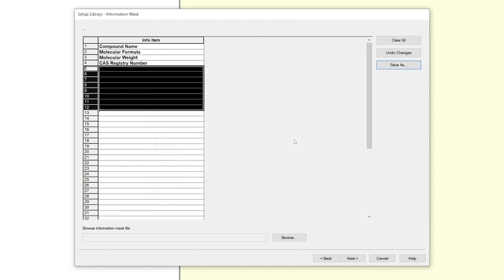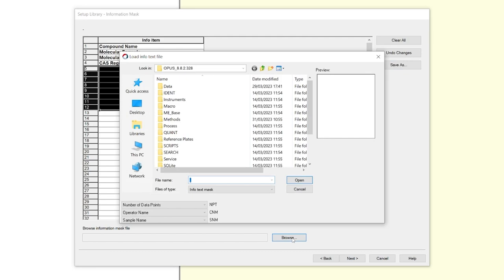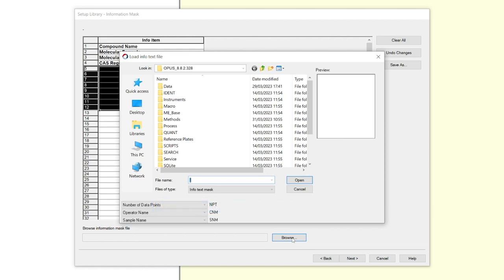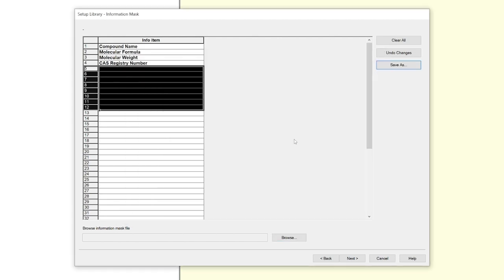If you want to open an existing preset, you can do so with the browse button at the bottom. The path of the pre-installed masks is the install path of your latest OPUS version, then either in the folder methods or in the folder data library. Regardless which way you choose to edit the info items, pay attention to what your first four entries must be. After you change the information mask, press next.